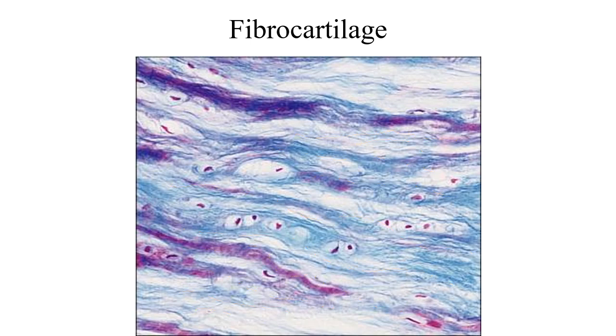And so with that, we have very good compressive strength. We can push on it and push on it, and it doesn't give way. And so that's why we use it in places like the intervertebral discs and the meniscus of the knee.